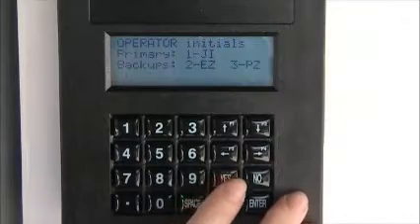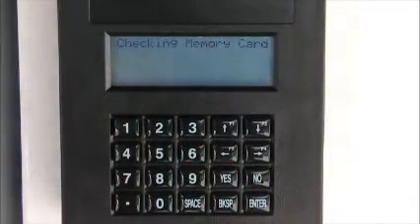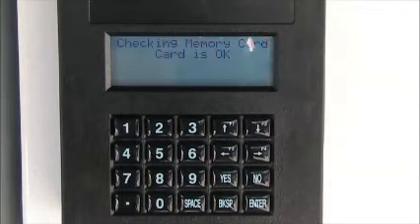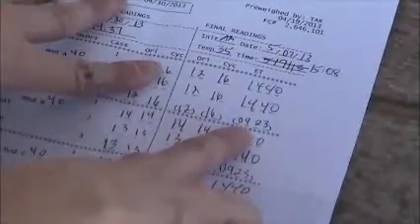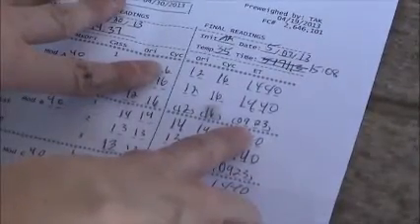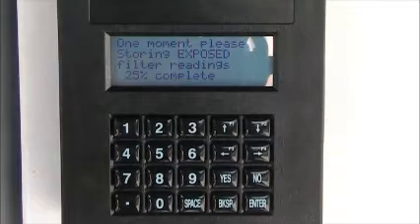You will perform final readings as usual, with the exception that the position 3 final reading entries will have parentheses around them. This is because the sample has not yet finished. Record the values provided for the 3rd position for each module. The controller will not ask you to change the flashcard at this time. It will prompt you to install the bag with today's date.